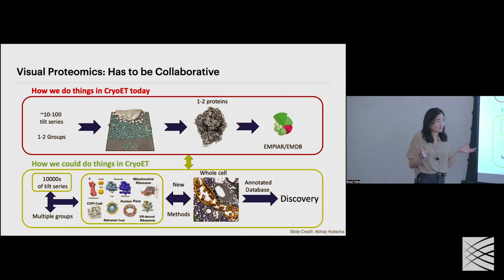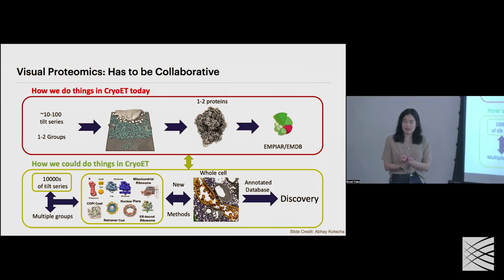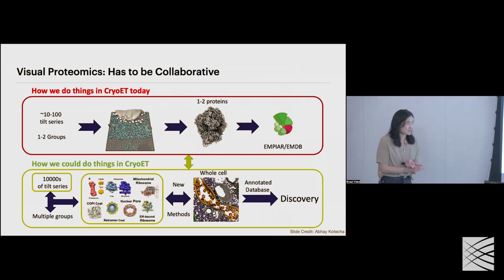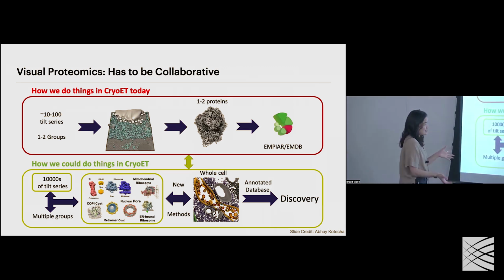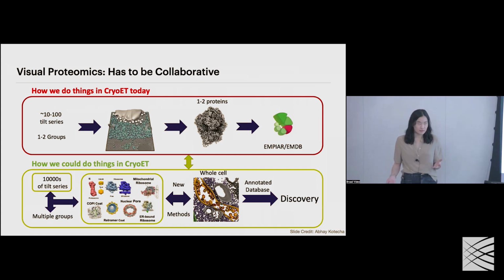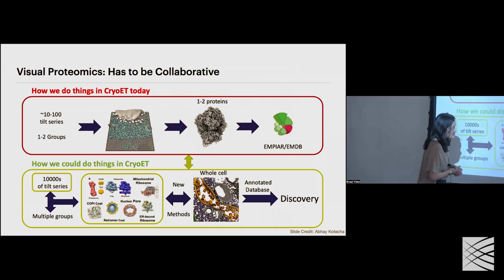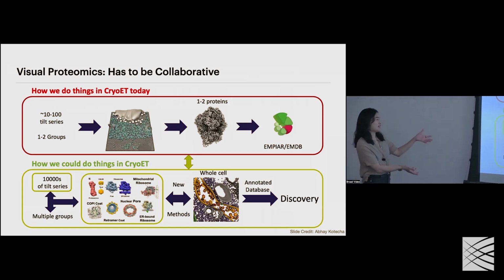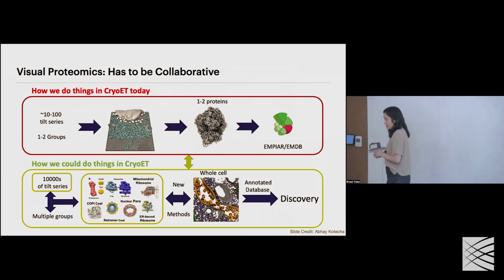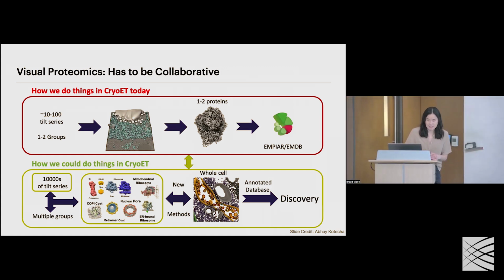One, it's much larger in scale. It's much more expensive experimentally to collect the data, and extremely expensive computationally to process the data. It's very, very hard. And the data set doesn't just give you a single structure. It gets you the entire molecular details of the whole organism. And so I think there's this new paradigm that especially folks at the Chan Zuckerberg Imaging Institute are really inspired to do, which is instead of all working on different things, all collaborating together and analyzing as a community.